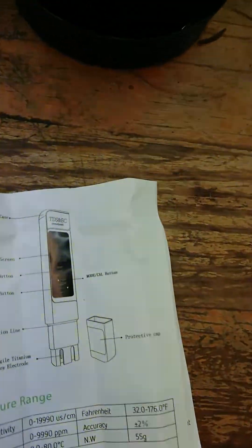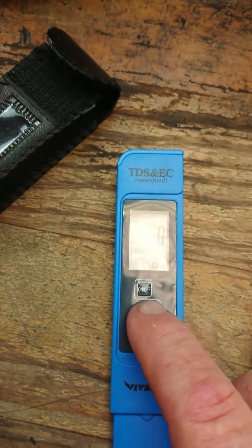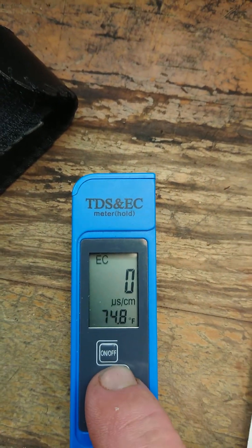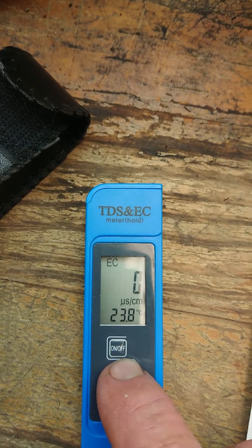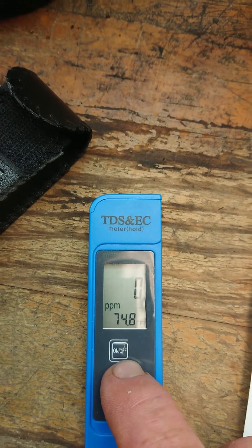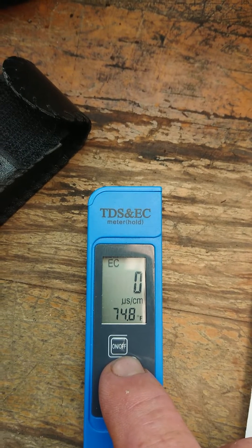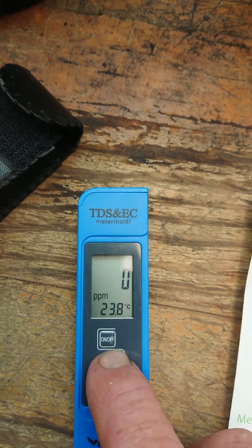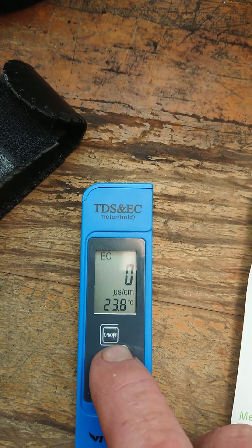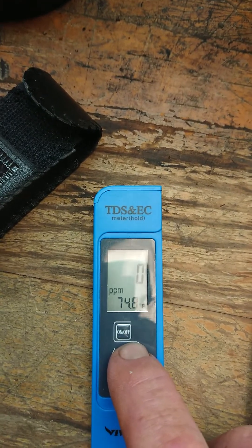The Vivosun unit can only be calibrated when it is in EC mode. When you push the mode button it changes the mode from parts per million to microsiemens per centimeter, in both Celsius and Fahrenheit temperature displays — so it has four different modes. You can calibrate in either the microsiemens per centimeter EC mode with Fahrenheit, or the EC microsiemens per centimeter Celsius mode, but you cannot calibrate in either of the parts per million ranges.